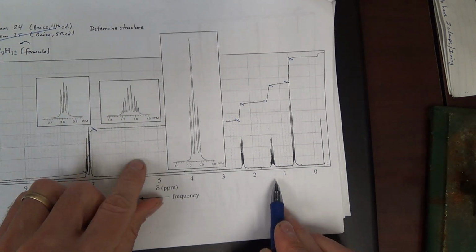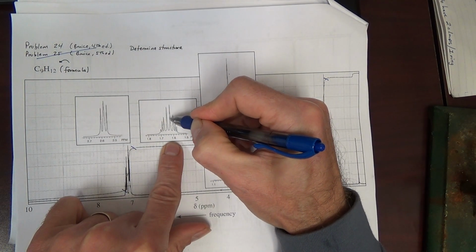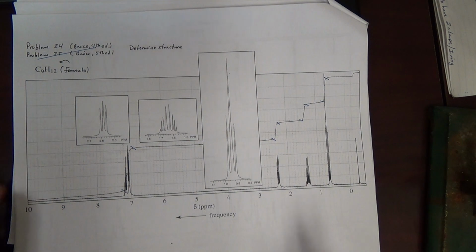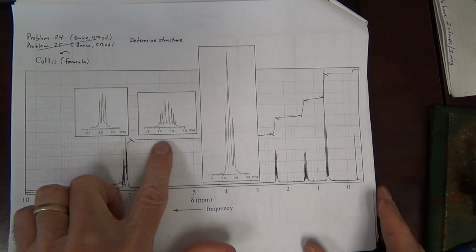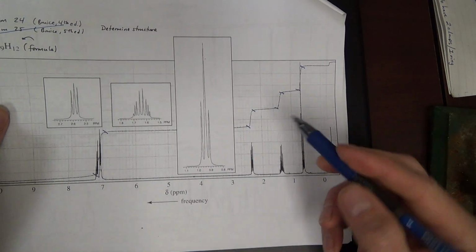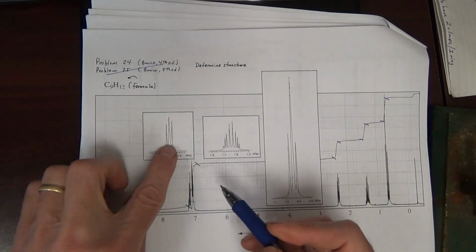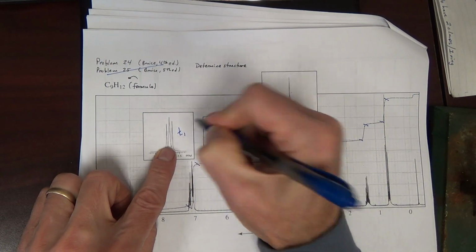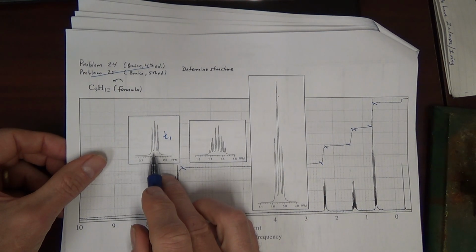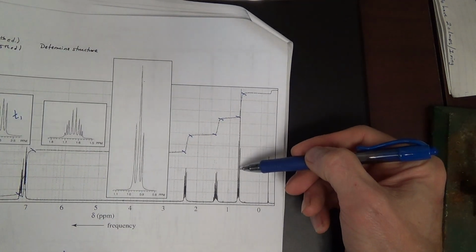For example, this one at about 1.5 has been expanded here. So you can see the number of lines clearly. 1, 2, 3, 4, 5, 6, 7, 8 lines. Okay? That may or may not be critically important. They're just showing you that. Peak position, what does the splitting mean? Okay, that looks like a triplet. It's expanded here. Clearly a triplet. But for how many H's? H's needs to come from your integration. What makes that a triplet? What makes that a multiplet? And then we need to consider this peak.